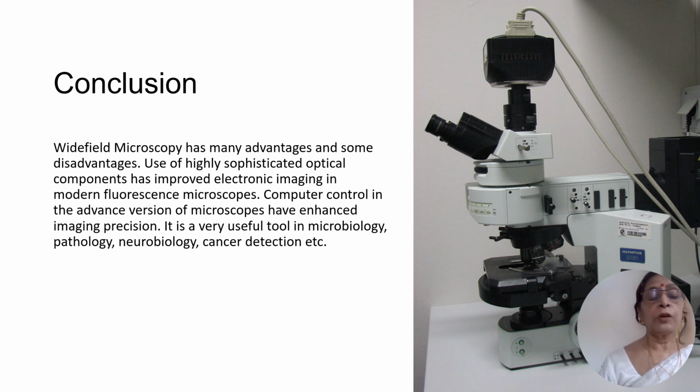The modern day fluorescence microscopes, specifically wide field microscopy, have very sophisticated electronic imaging devices attached to them. The optical components are sophisticated. There is computer control of the focusing, the adjustment of filters, etc. And it is a very powerful tool for the field of medical science, microbiology, and even for the detection of the cancer.